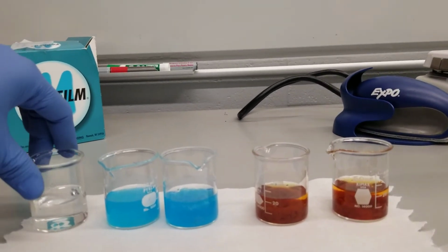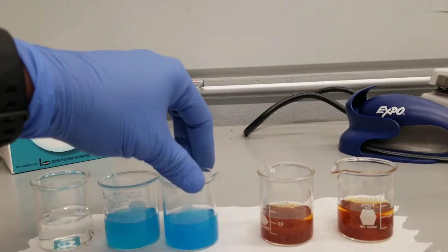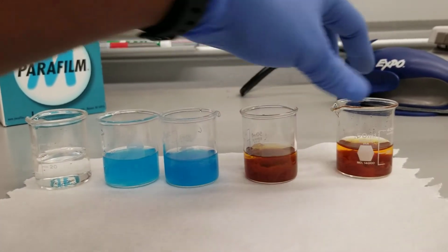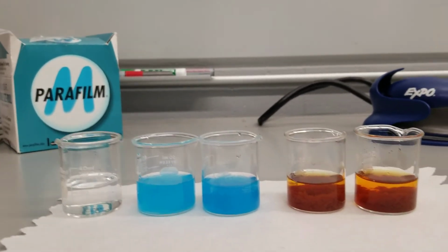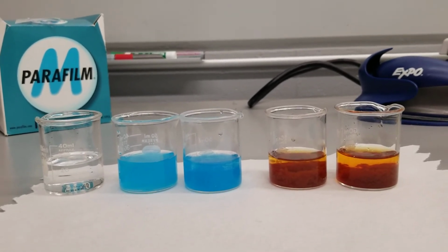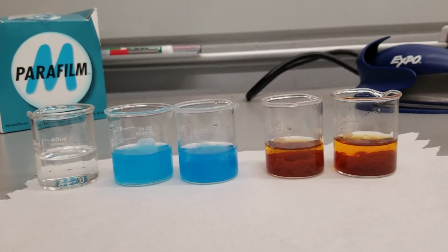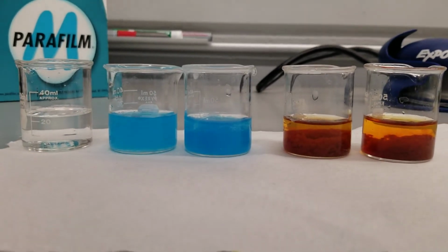So that's your control. That's your first copper-containing sample. That's your second copper-containing sample. That's your first iron 3 containing sample. And that's your last, or second, iron 3 containing sample. So in class, we're going to try to think through this, and I'll have you tell me which one you think has a higher amount of copper and iron respectively, based on the depth of the color and also the amount of precipitates formed.